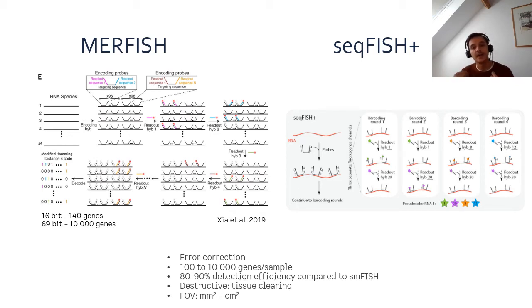It also has error correction. What I explained earlier about the mishybridizations, you also have error correction here, where if you have one change by any artifact, that does not mean that the barcode is going from gene A, let's say, to gene B. So there is room for errors, and we can also use these chemistries to correct for that.